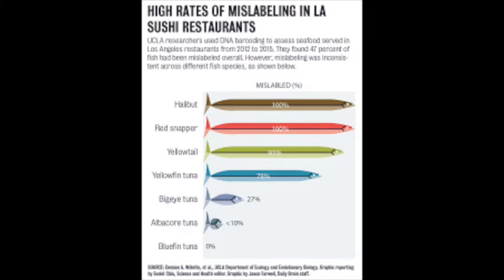In a regular year, you would actually select fish samples yourself from your favorite sushi restaurant or the grocery store, and we would actually test these in class. However, of course, this year we are using some made-up data from some made-up restaurants, but it will really tell us something about how these processes normally go.